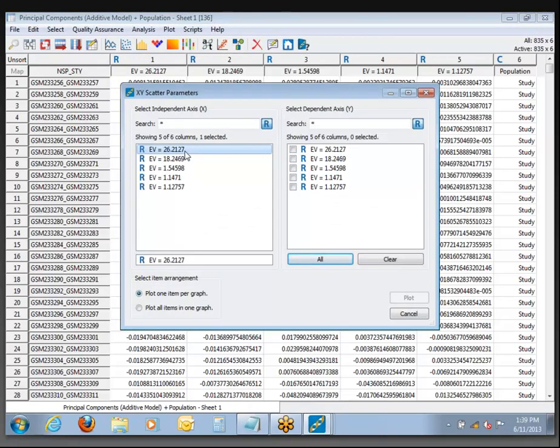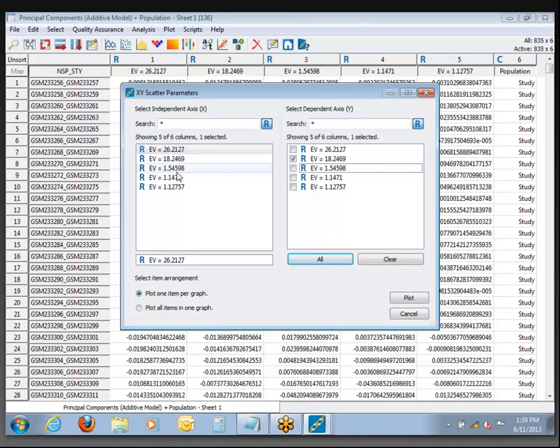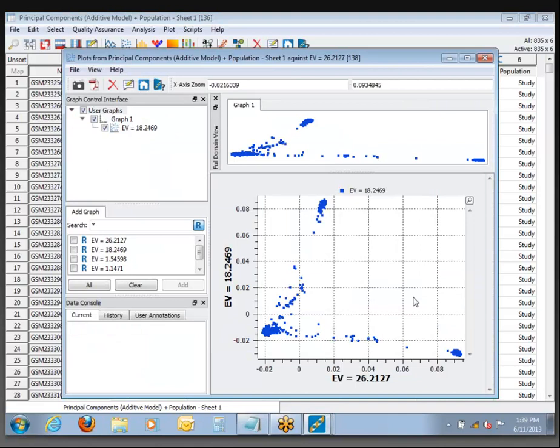We see a dialog where on the left we select the variable for the x-axis, on the right for the y-axis. We could select multiple y-axis variables — we'll just get the second component. We only allow for one variable to be plotted on x. Let's go ahead and run this. We've got the first eigenvalue that should be around 26 if you've been following with me, and the second should be around 18, and we get this plot.